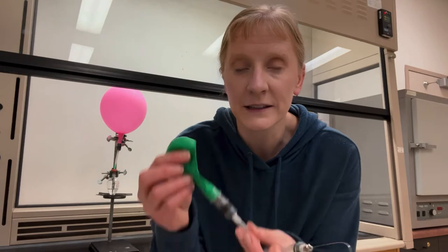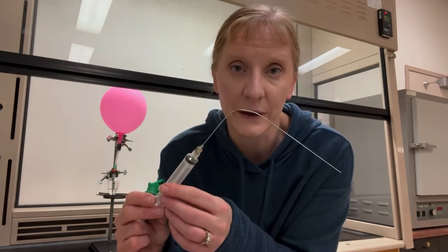So I'm going to flame dry a flask in order to remove water that can be attached onto the surface of the glass. And then I'm going to surround the flask with nitrogen gas using a balloon. And I'm going to add my reagents via a dry syringe.